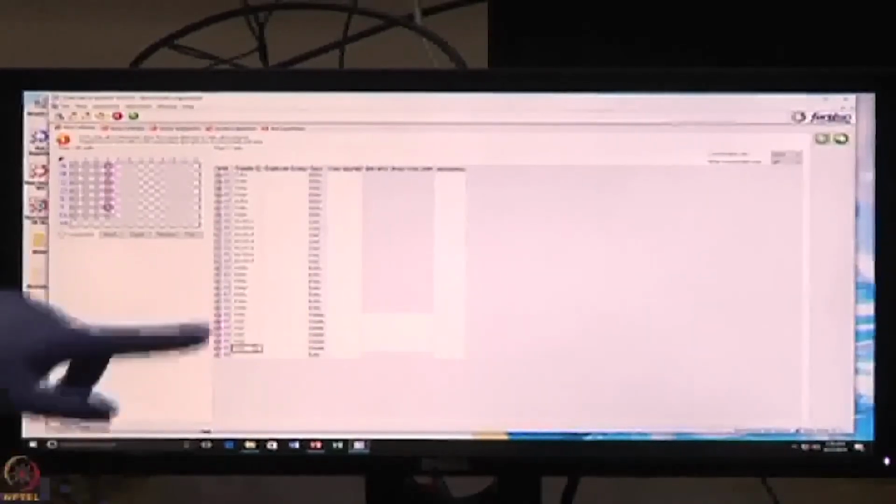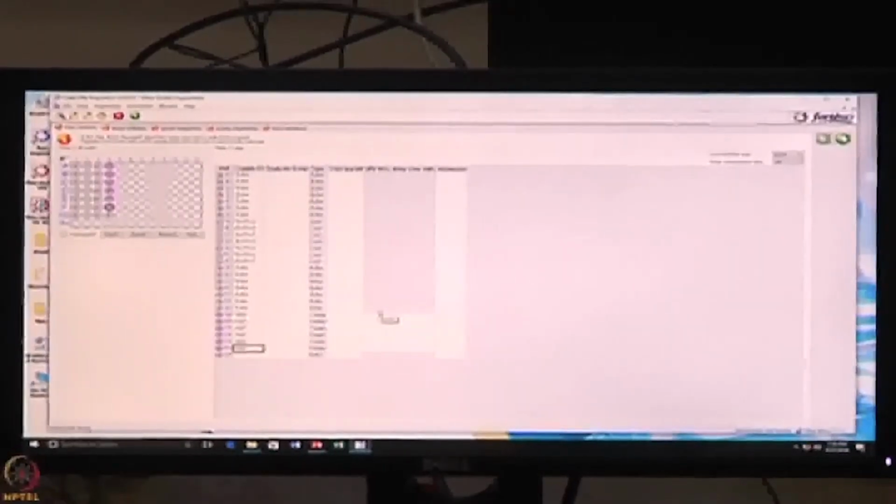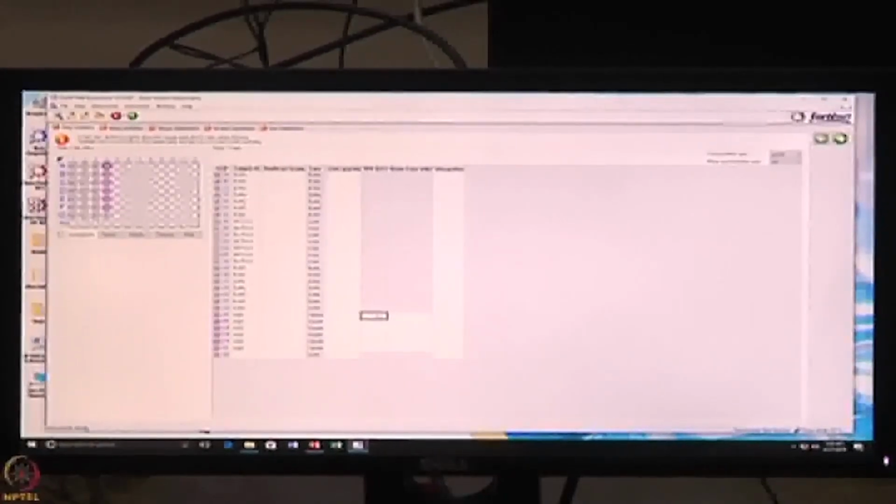The important thing here is for mouse IgG, you have to mention your concentration, because if you do not feed the concentration, you will not get the KD value. Concentration is one of the parameters when you are calculating the KD, kinetic constants, rate constants. So the concentration parameter is important.